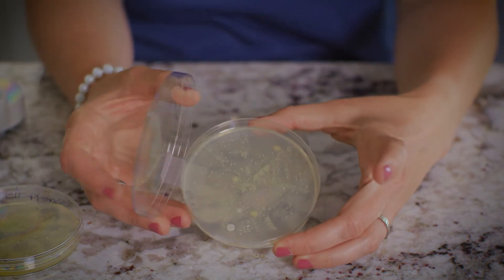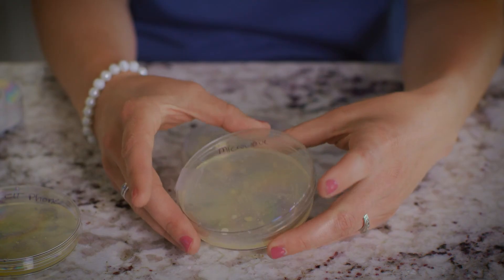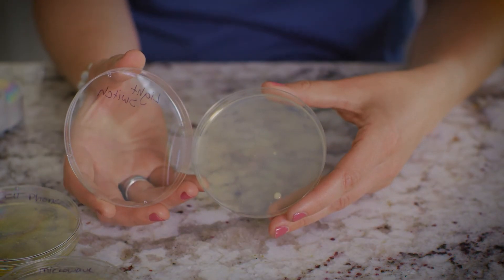Here's the microwave. Look at all that. That one has a lot of growth in it. And the last one is the light switch. Not too bad.